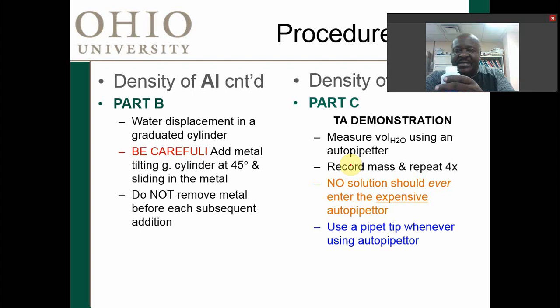So here's an auto pipetter. When you press this, you can actually press it to the first resistance point, and if you press on, get to the second.